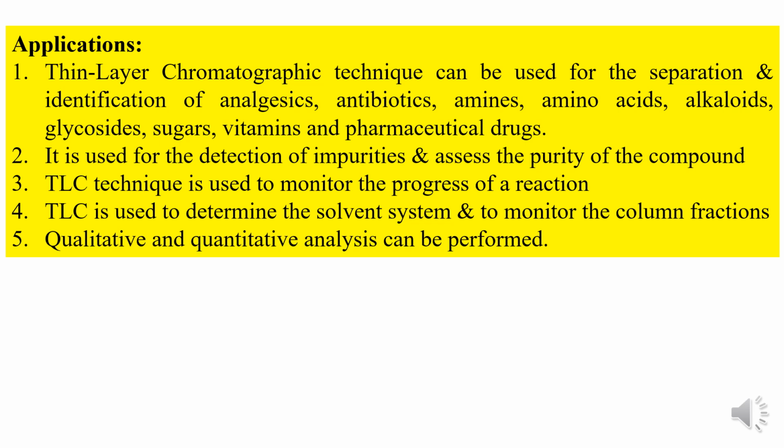Now moving on to the applications of this TLC technique. Thin layer chromatography can be used for the separation and identification of analgesics, antibiotics, amines, amino acids, alkaloids, glycosides, sugars, vitamins and pharmaceutical drugs. It is used for the detection of impurities, and one can also assess the purity of a compound.